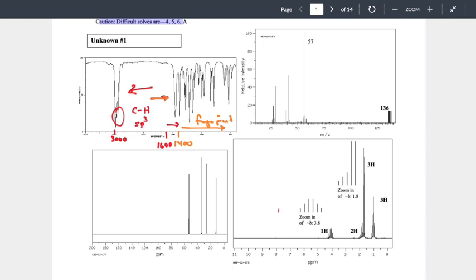Largely the same reason. A lot of stuff can show up in that range. It's really easy to overanalyze it. And so where I want to focus is in the places where it's easier to get a correct absolute answer, as opposed to going, is that a carbon-carbon double bond, or a carbon-nitrogen double bond, or a carbon-oxygen?